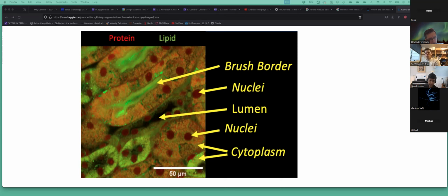So I imagine some sort of a probabilistic joint model of this image, which to each pixel assigns a probability that this pixel is within the nucleus versus within the tubule of a certain kind, which would have some sort of a prior built-in on sizes of nuclei and sizes of different objects. Does that make sense to you? I think it makes sense. But the final task is not quite clear. What do you want to predict, or what inference do you want?